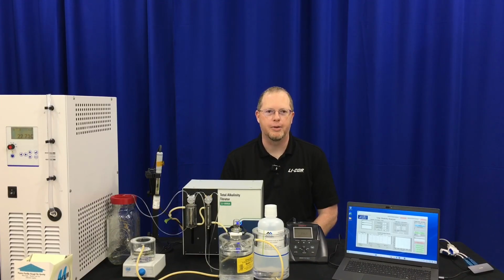This one is going to be about setting up the LI-5800A analyzer, alkalinity titrator, after the unboxing and making sure that everything is connected properly.